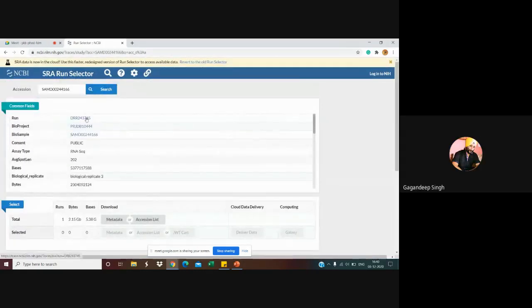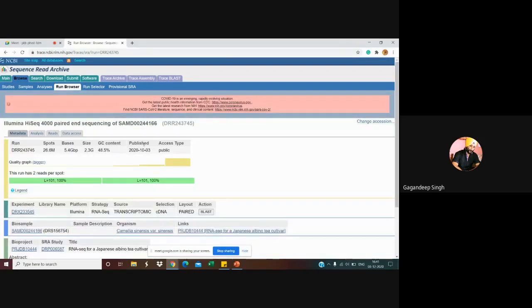Oh, no, there is not one run. Please copy this run. Do you have that copied? I have told you to copy that particular run. Not the number, no problem. Just copy that run.